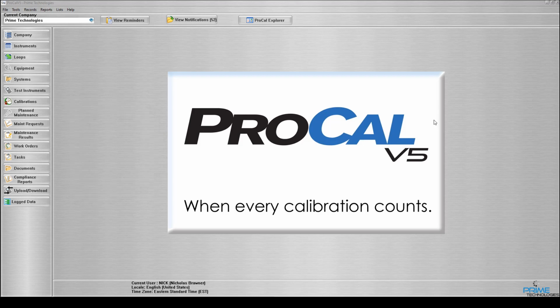the CTL value. Once your values have been entered and applied, you can close the scale balance test data screen, select pass or fail for your calibration, and save your record. And that's all there is to it. Now you can use the scales and balances test type package in ProCalV5. Thank you.